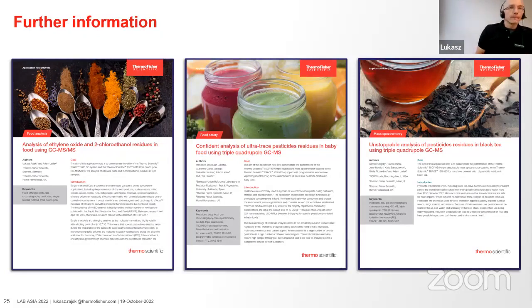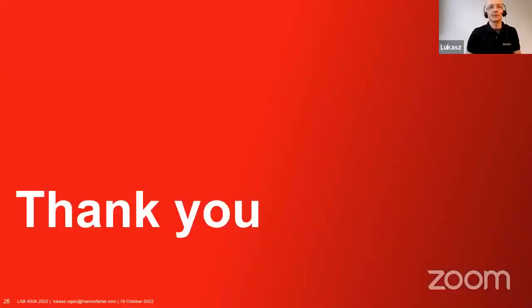We also have some other application notes related to pesticide residue analysis with our new instrumentation, the TSQ 9610. We have an application note where we described analysis of pesticides in baby food and pesticides in black tea. Okay, thank you very much for your attention.